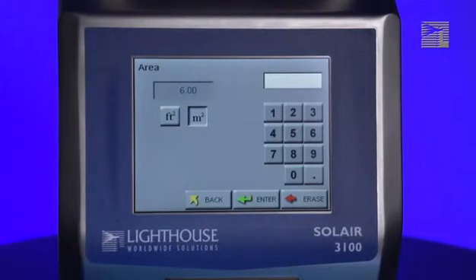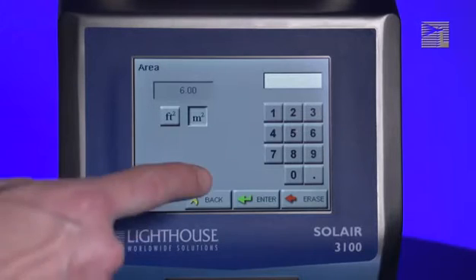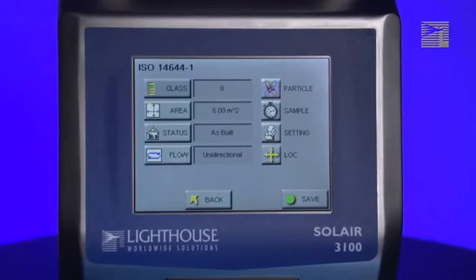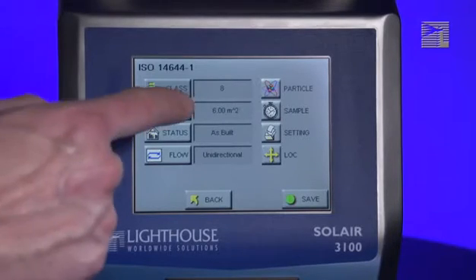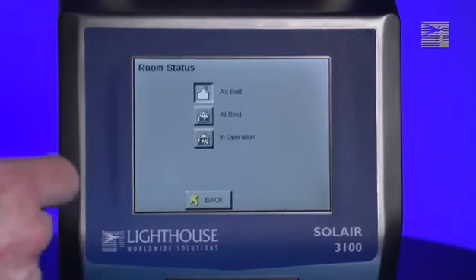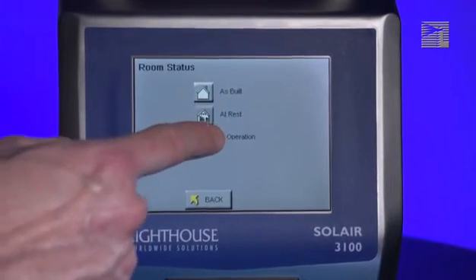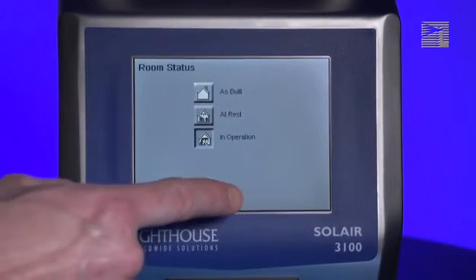Once you have successfully set the area, press the Back button to return to the report setup screen. To set the room status the cleanroom is in while the samples were recorded, press the Status button. Select the appropriate cleanroom status. When you are finished, press the Back button.